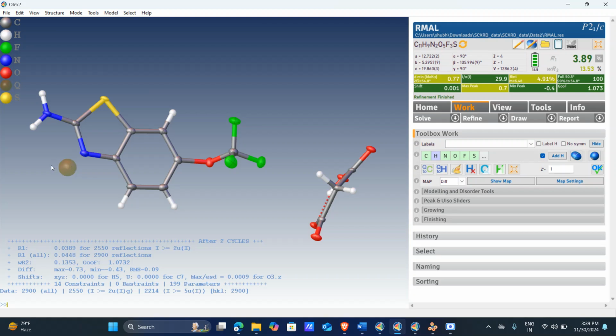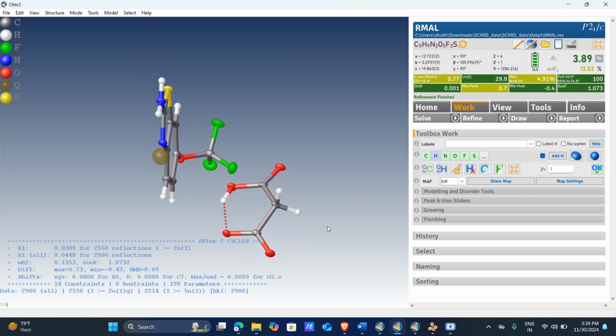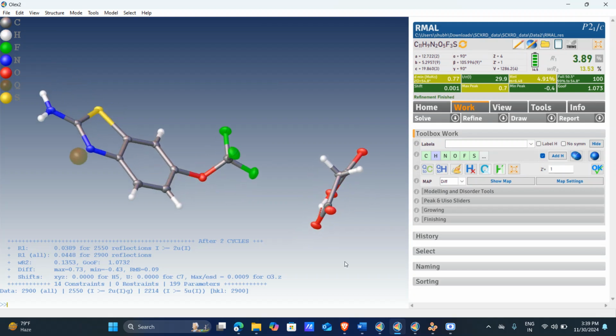So this electron density is maybe due to the lone pair attached to it. So we will try to avoid the hydrogen atom attaching here. And this is the structure of malonic acid, in which we have three carbons, and the other two carbons are basically the carboxyl group, carboxylic acid, and there is hydrogen bonding present there also. So this is the structure of riluzole plus malonic acid.